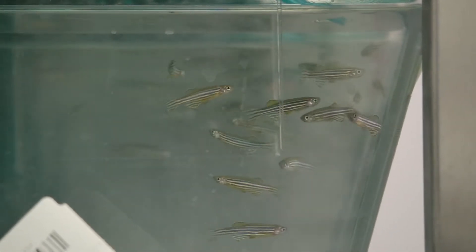Zebrafish are vertebrates just like we are, which means that many of the things that we find to be true in zebrafish are also applicable in human contexts.